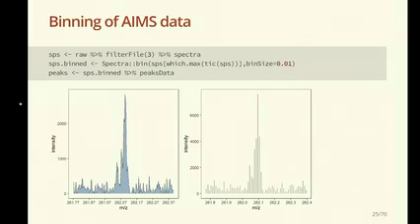If you look at the left side, the raw spectral data, and then you apply some binning on the right side, we lose a lot of the intricacies of how the spectral data looks. The accurate mass is lost. But I must say that from a chemometric profiling perspective, we can often have at least very decent models. So there's still very much use to it, but there are some limitations as well. And you must choose whether you find one thing more important than the other.